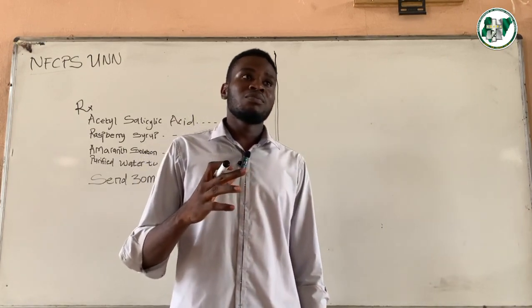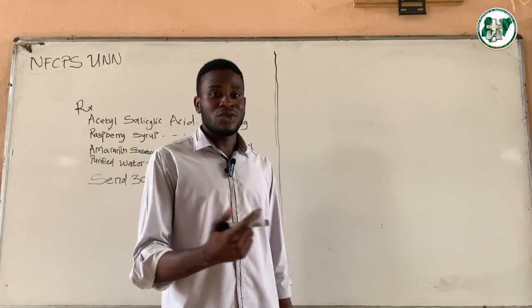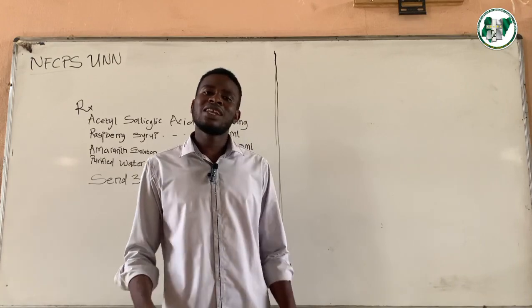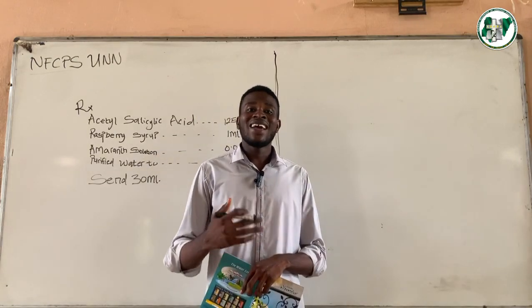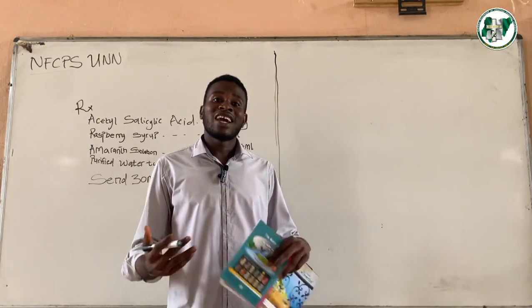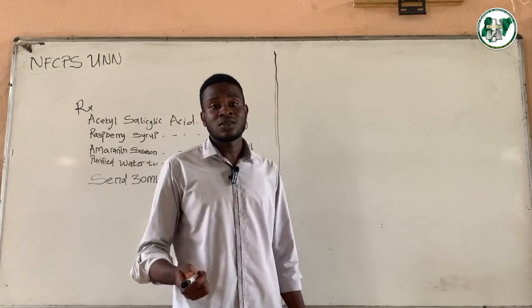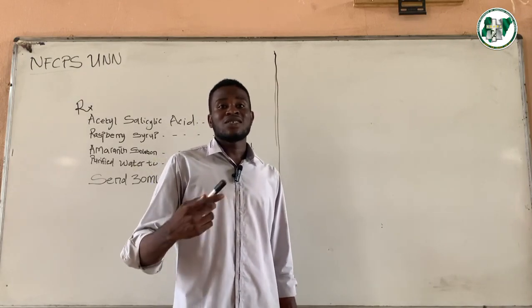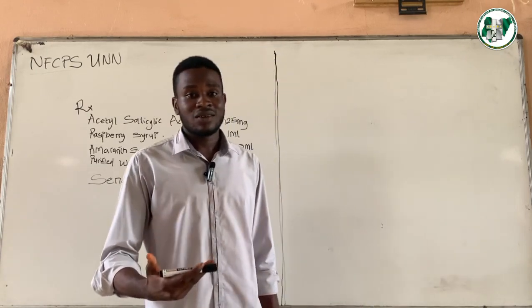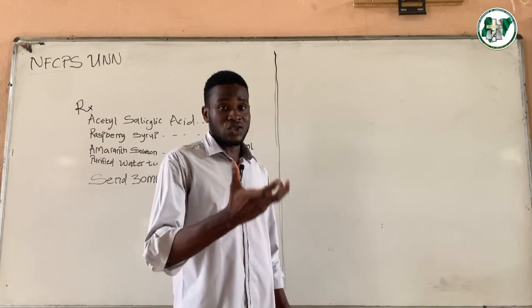Because in the preparation of suspensions, we have two types of APIs that are used: readily diffusible APIs and non-readily diffusible APIs. For readily diffusible APIs, we do not require a suspending agent, because they are readily diffused, or evenly distributed, in the suspension. Meanwhile, non-readily diffusible powders get sedimented in the container, right? So that's why we require a suspending agent to keep this API suspended in the suspension.